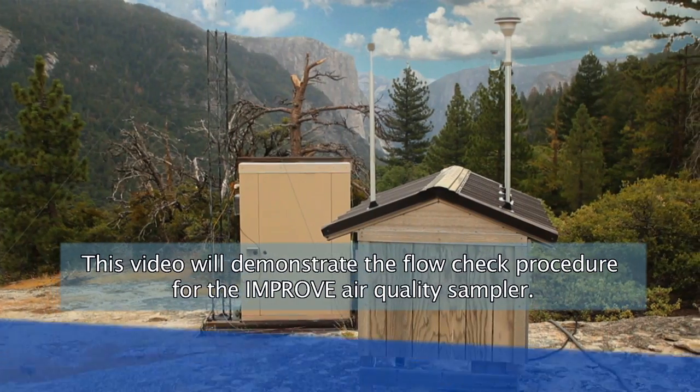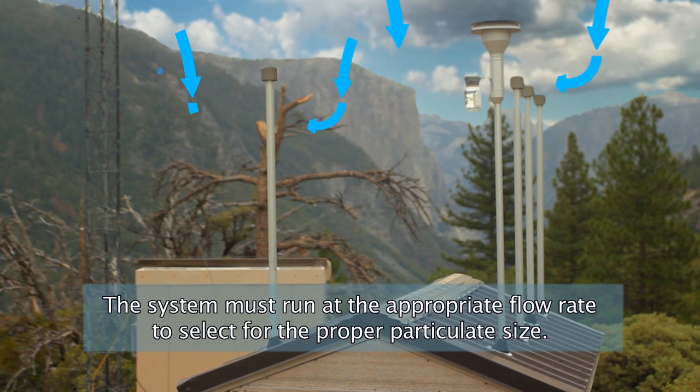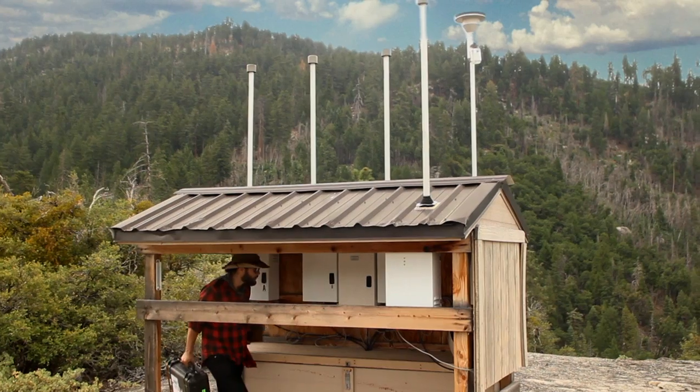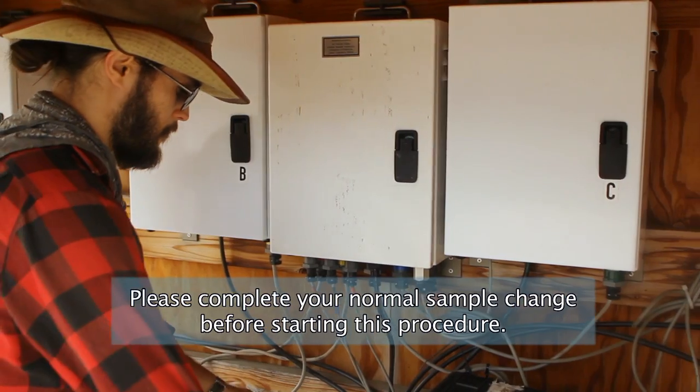This video will demonstrate the flow check procedure for the IMPROVE Air Quality Sampler. The system must run at the appropriate flow rate to select for the proper particulate size. Please complete your normal sample change before starting this procedure.